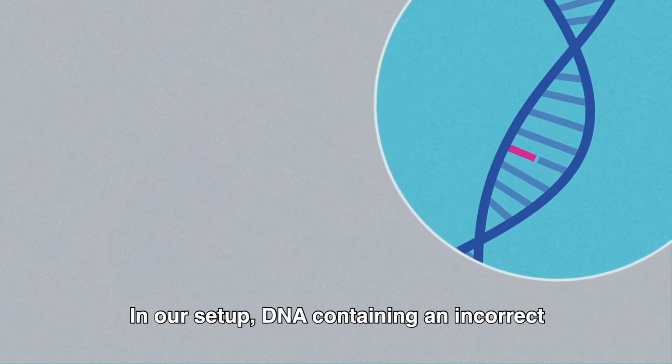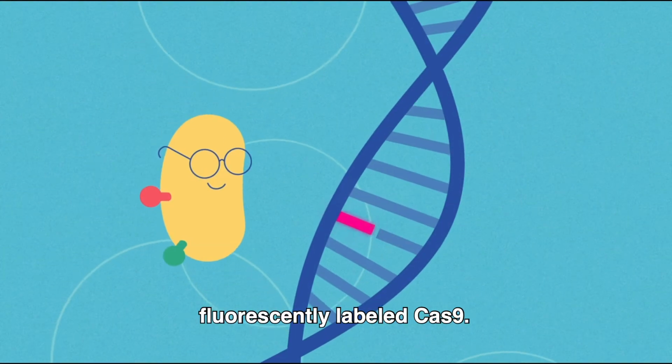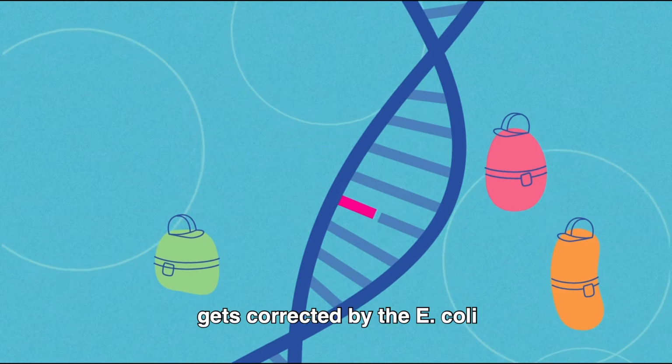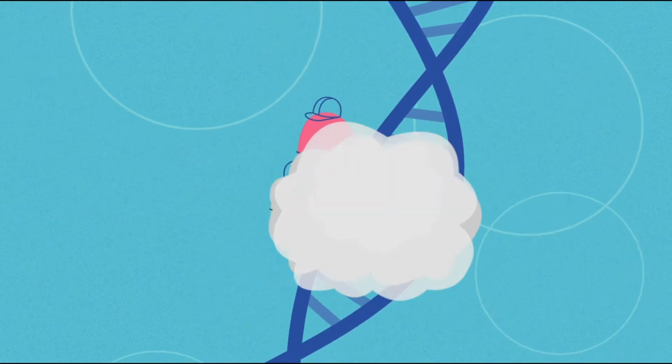In our setup, DNA containing an incorrect nucleotide cannot be bound by the fluorescently labeled Cas9. First, the mismatched DNA molecule gets corrected by the E. coli DNA mismatch repair proteins.